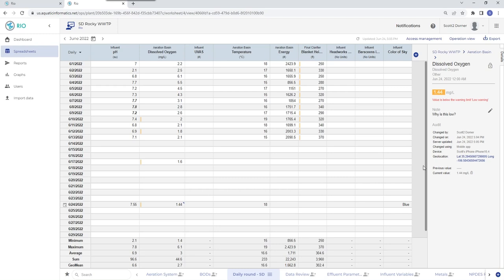We do have knowledge base articles about how to turn off tracking on your phone, and then our application won't be able to do it. That's pretty much it. That's what the mobile app is used for. It automatically gets your forms. You just go ahead and enter your data. It's automatically synced to the cloud, and then you can go on with your day.